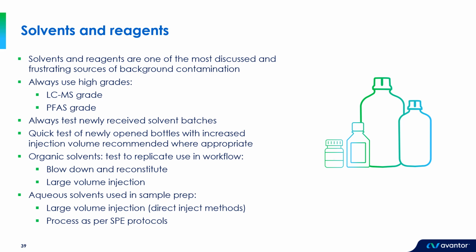So a general recommendation would be to always use as high a grade as you can. That would either be LCMS grade, or more recently, we've seen a number of manufacturers introducing special PFAS grade solvents, which are typically batch tested to conform with a PFAS testing methodology.